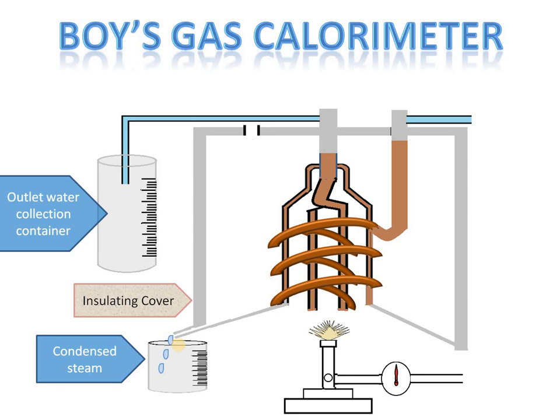During the combustion of the fuel, hydrogen from the fuel will get converted into water molecules. This water produced during combustion will be condensed and collected in this container at the bottom of the insulating chamber, which will be further used to calculate the LCV of the given fuel.